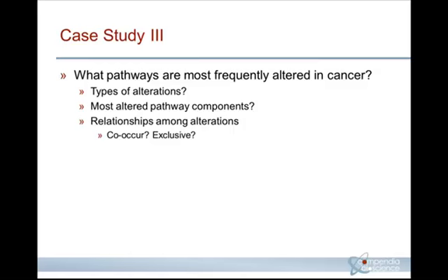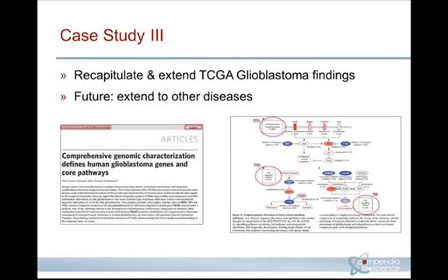I know that this paper has been out now for a couple of years, and everyone's probably familiar with the findings. I think the exciting thing that we're doing here is building systems to automatically make, in a very intuitive way, the observations that are being made by these fairly lengthy and exhaustive TCGA studies. As all of this TCGA data becomes available, copy number, expression, mutation, it'll plug in nicely into our tool set such that similar observations for other cancer types can be readily made. I'll also show you an example of things that we think we've pulled out via our analysis that were missed by the original TCGA study.